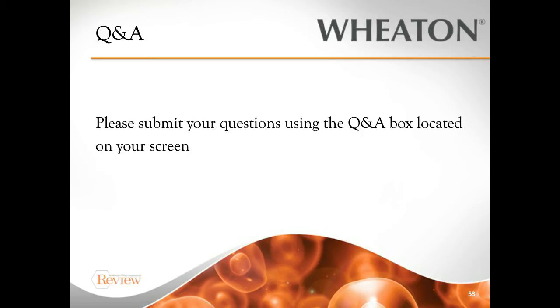Great. I think we have time for one more question. And Jeff, I think this one's directed at you, which is, do you have any experience in gamma irradiation of COC polymers, and have you seen things such as color change or any impact to the product?